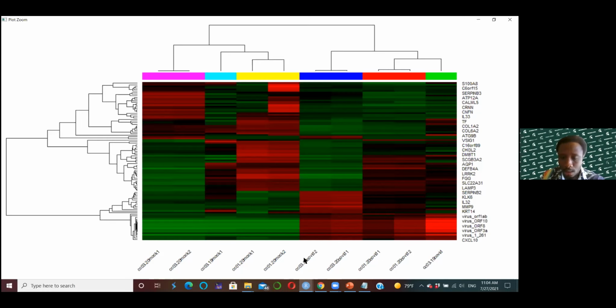and then the experimental group here, right? And also when you look at their mock group, which is the CCO120 mock 1 and then CCO120 mock 2, right? You can differentiate them from the CCO120 COVID-1, and then CCO120 COVID-2, right? So from this, this tells you a lot about some of these genes that you think are being affected by COVID-19.